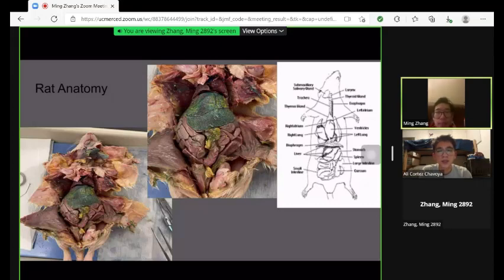We do not get to dissect the rat's head, so we can't show the brain, but there are some nerves showing. They control the rat's motor functions. Overall, the streamlined way that the rat is made up allows it to be flexible and be able to easily adapt to its environment. It is showcased by its strong hind limbs and flexible forelimbs, which it uses for locomotion.